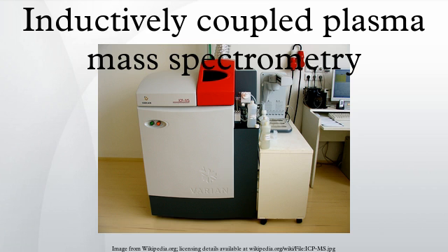ICP-MS also lends itself to quantitative determinations through isotope dilution, a single-point method based on an isotopically enriched standard. Other mass analyzers coupled to ICP systems include double-focusing magnetic electrostatic sector systems with both single and multiple collector, as well as time-of-flight systems.